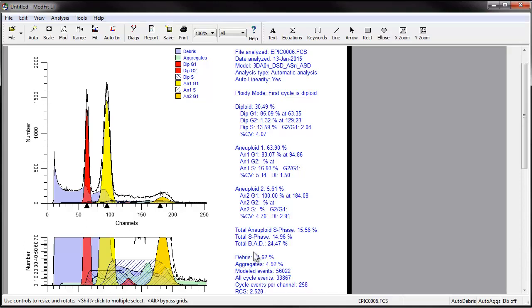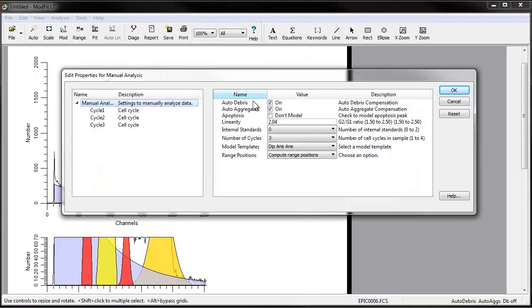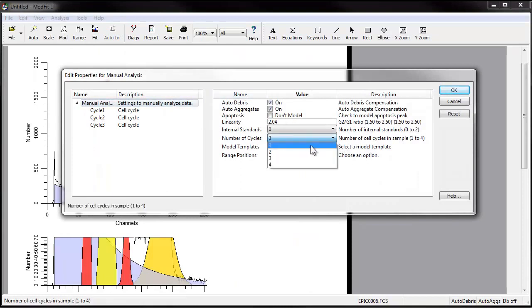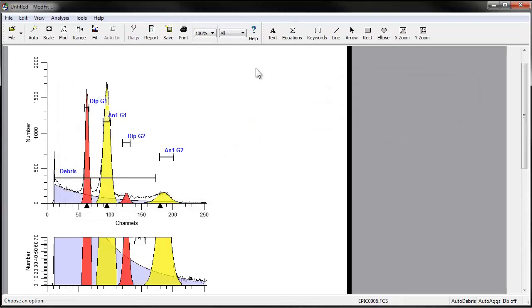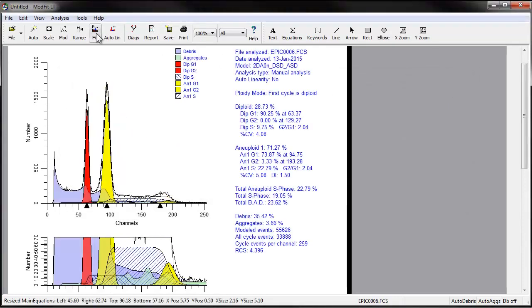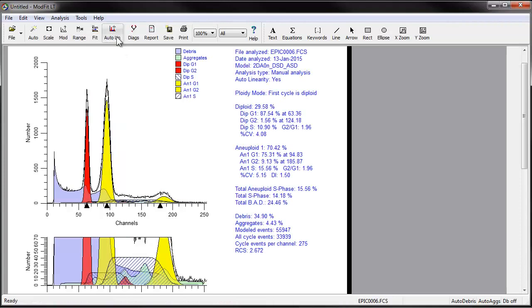Experienced DNA analyzers will recognize that this file is still not done. With the on-scale data that we see, we should now do a 2-cycle manual analysis of this file. Manual analysis is covered in another video tutorial. As you see, autolinearity is available for manual analysis too.